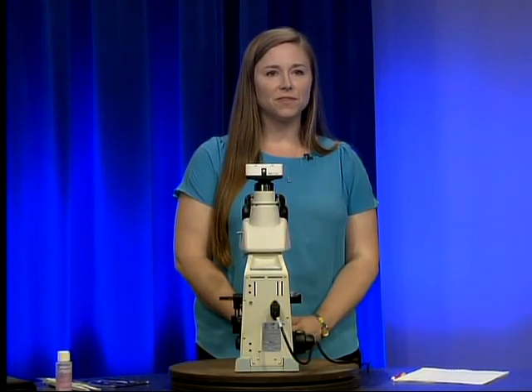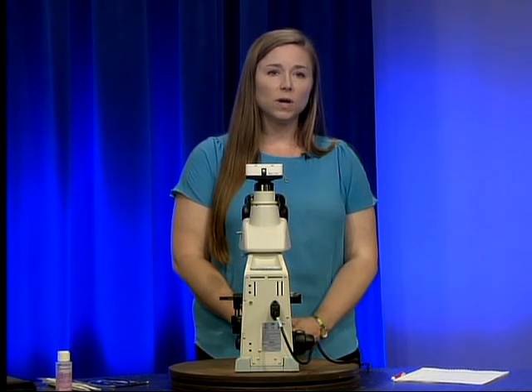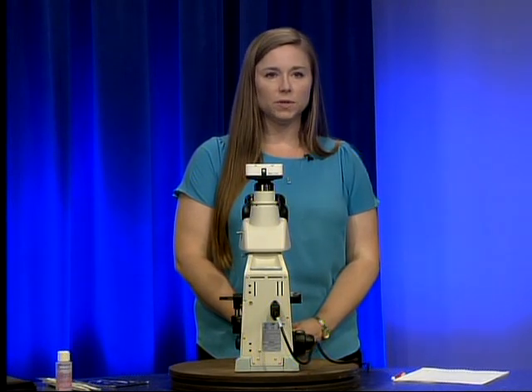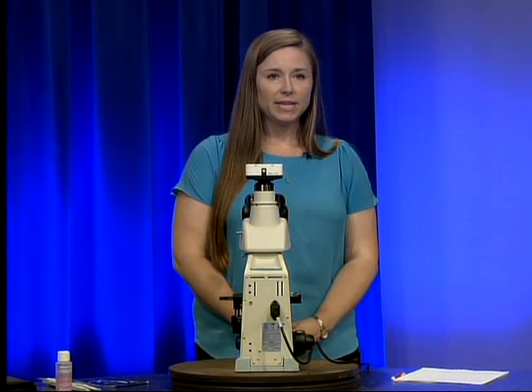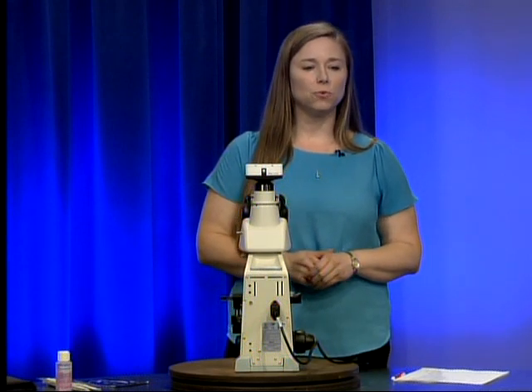Welcome to video three of four of the County Health Department Nikon Eclipse E100 microscope introduction series. This video will cover cleaning the Nikon Eclipse E100 microscope. I'm Ashley Meglin, a technical consultant for the Alabama County Health Department laboratory system.